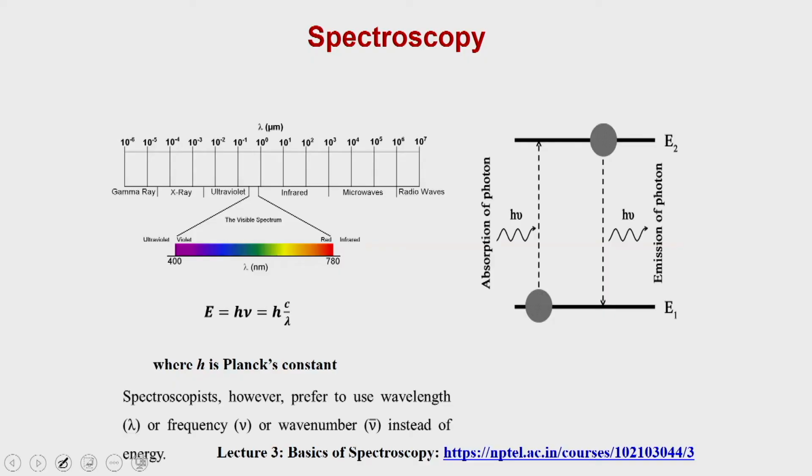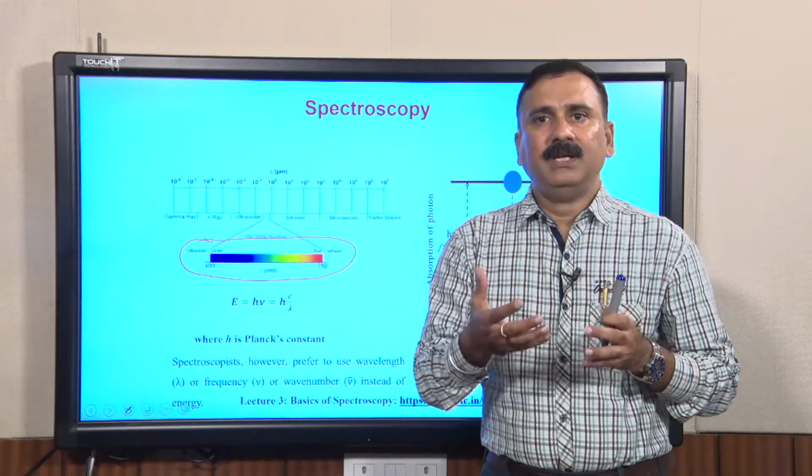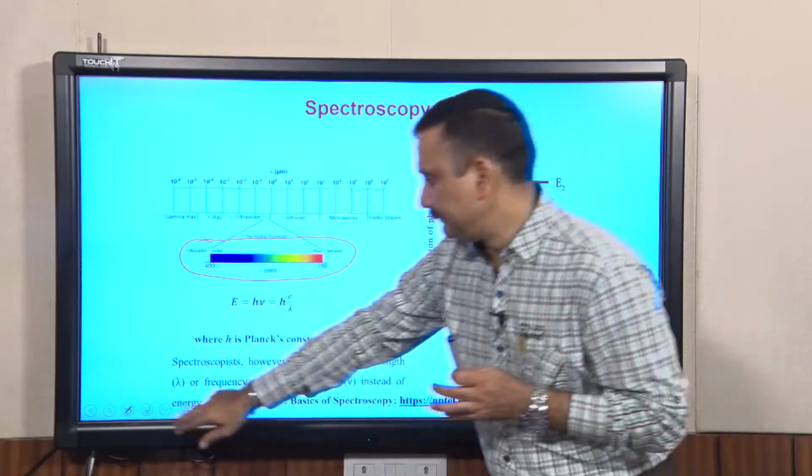So, this is what we were discussing about spectroscopy. We started with UV visible spectroscopy in the previous lecture, and what we have said is that UV visible spectroscopy is sensitive to the electronic transitions within the molecules. Now, in today's lecture we will see how the electronic transitions can be used even to map the perturbation, or the structural changes, in the molecule.